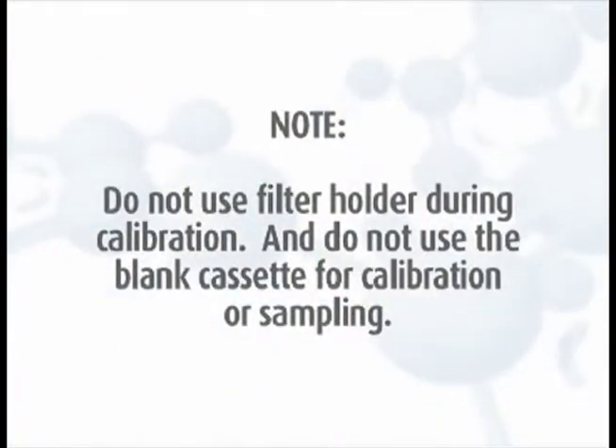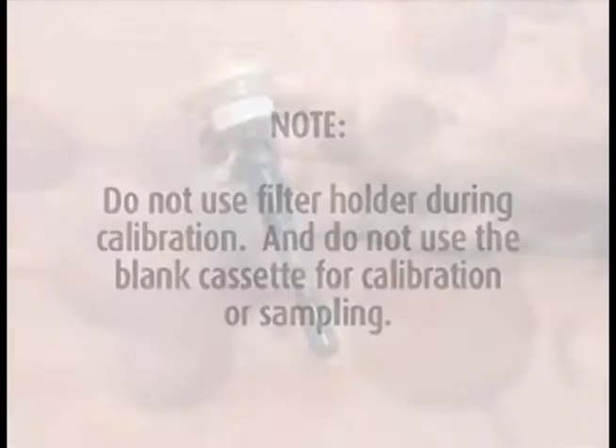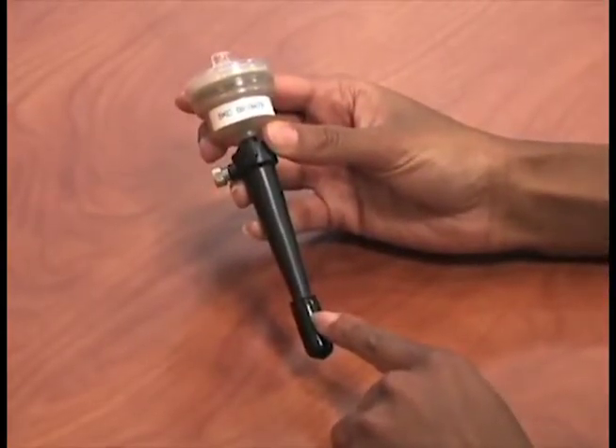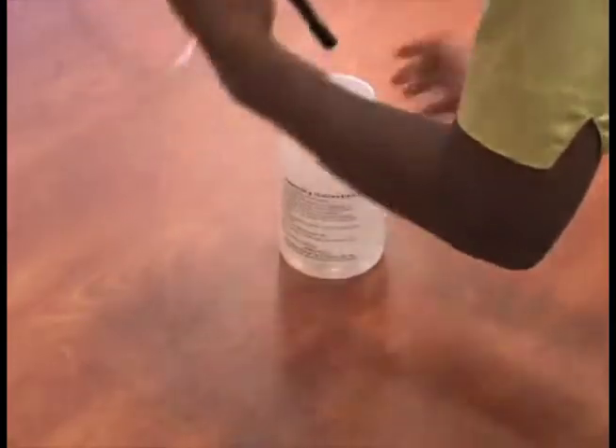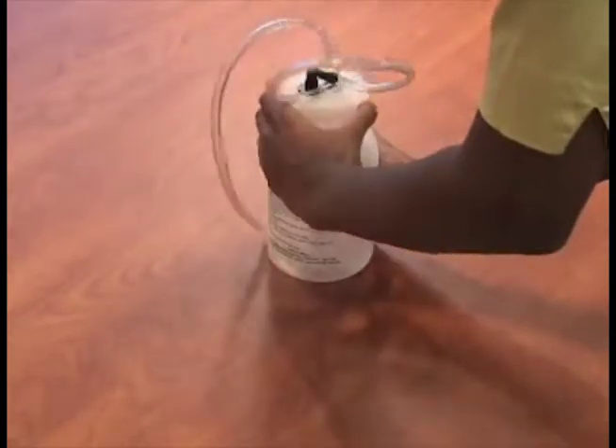Do not use the filter cassette holder during calibration, and do not use the blank cassette for calibration or sampling. The grit pot must remain on the cyclone body during calibration. Place the assembly into an airtight calibration jar with an inlet and outlet.